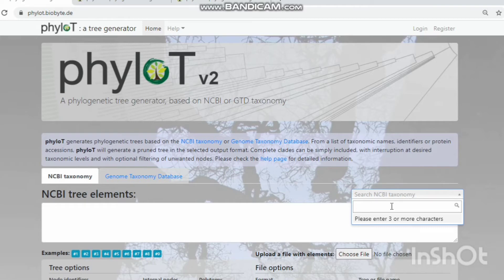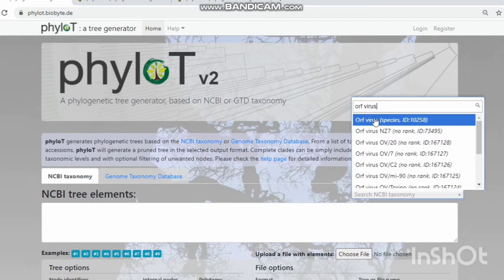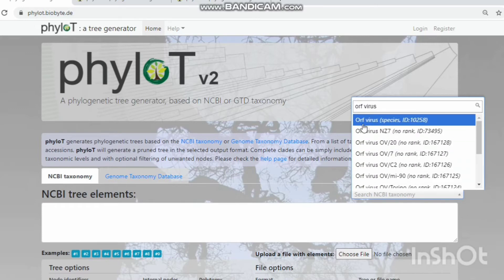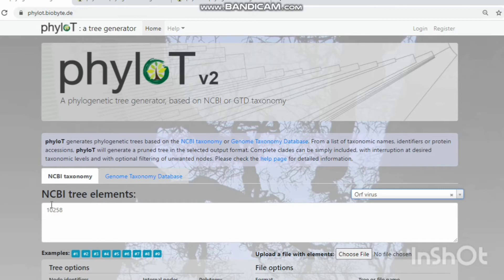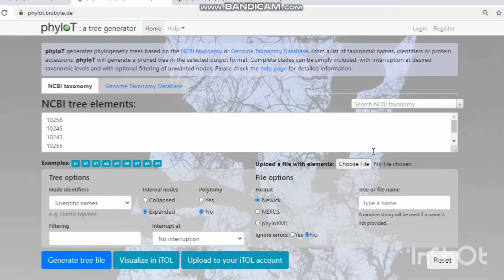I give the ORF virus as input. The species name is searched on the NCBI taxonomic database and gives the result — the first one is the species scientific name and the other is the NCBI taxonomic ID. I click the ORF virus and note the taxonomic ID in a text file. Then I add the other species names in the input box. Alternatively, you can use the 'Choose File' option to select a species file to generate the phylogenetic tree.